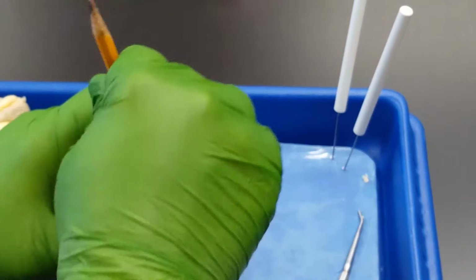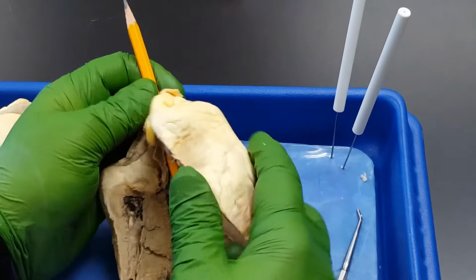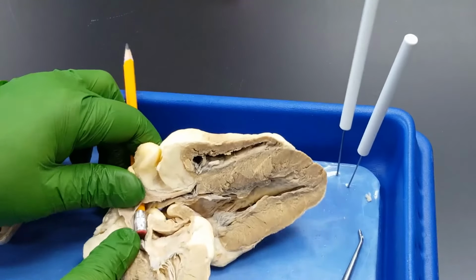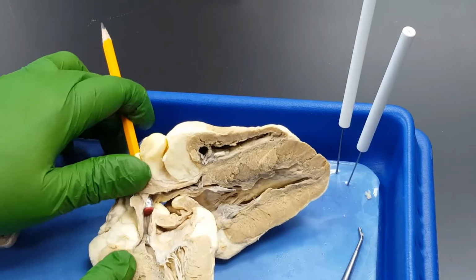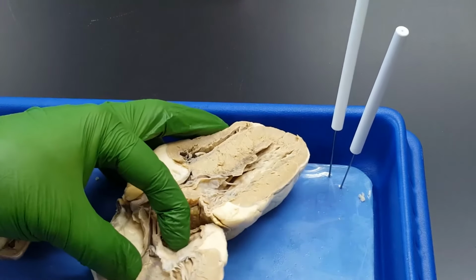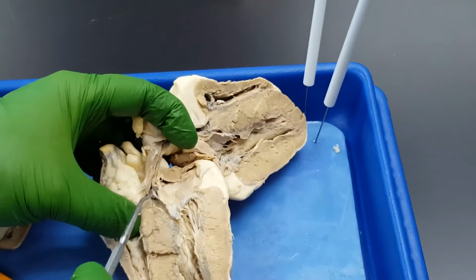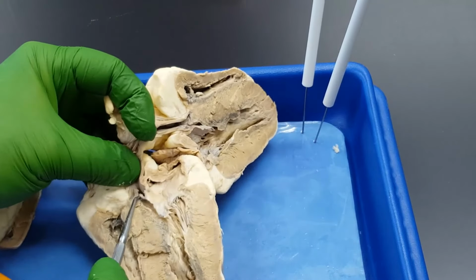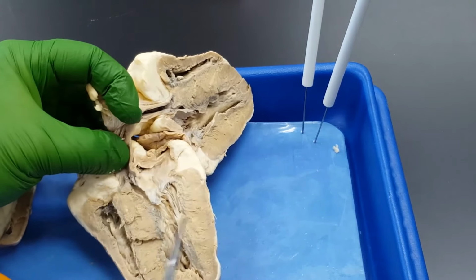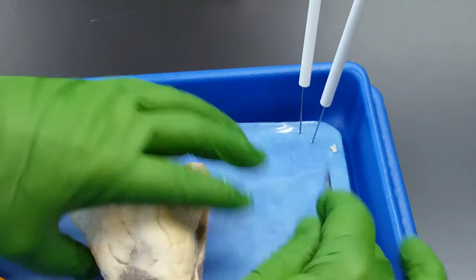If I stick my pencil again through the aorta, notice it's skewing to his left. This thing right here, look at where the eraser is, this is the aorta. And at the bottom of it, right here, I'm moving one of those semilunar flaps. This thing, hopefully you can see it. And again, if the camera work isn't that great, make sure that you're paying careful attention in the practice section. No cords. This is the aortic semilunar valve. Left ventricle, follow it up. Aortic semilunar valve.